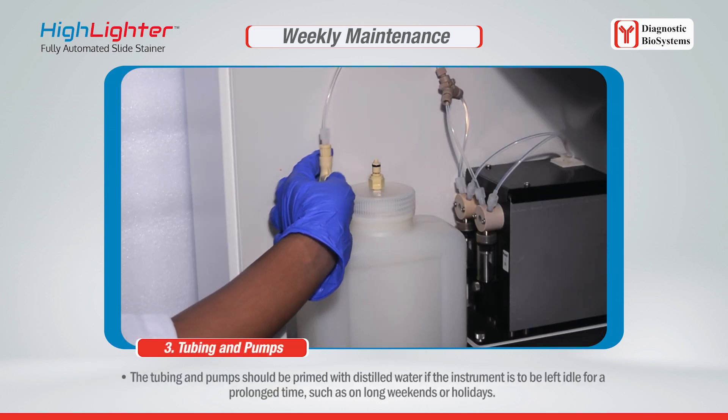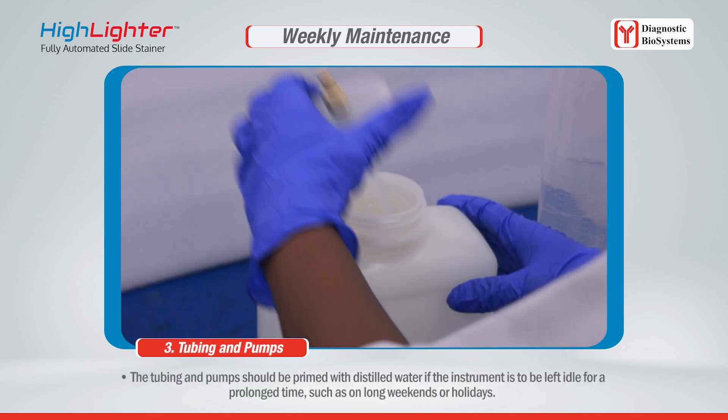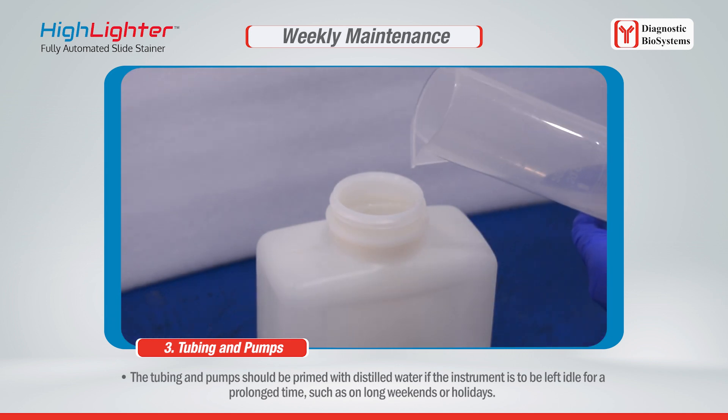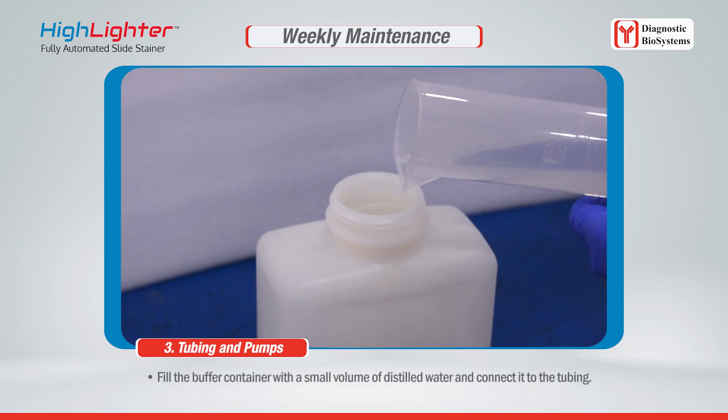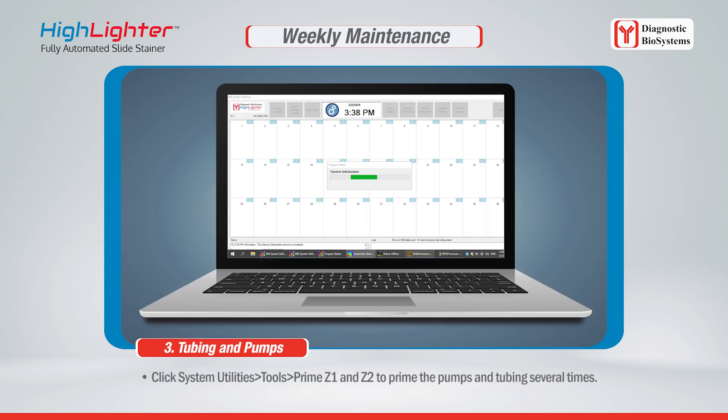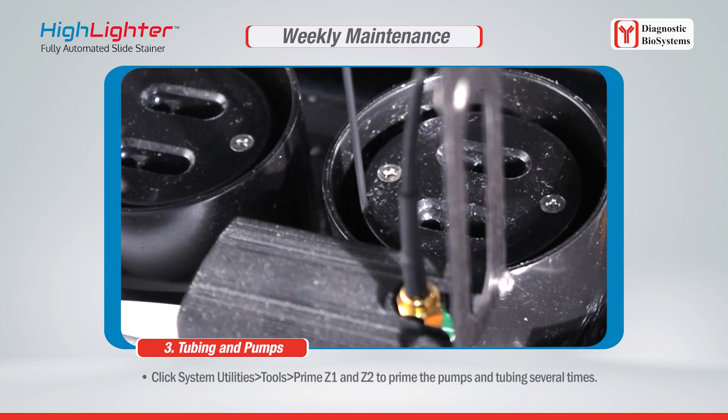The tubing and pumps should be primed with distilled water if the instrument is to be left idle for a prolonged time, such as on long weekends or holidays. Fill the buffer container with a small volume of distilled water and connect it to the tubing. Click System Utilities > Tools > Prime Z1 and Z2 to prime the pumps and tubing several times.